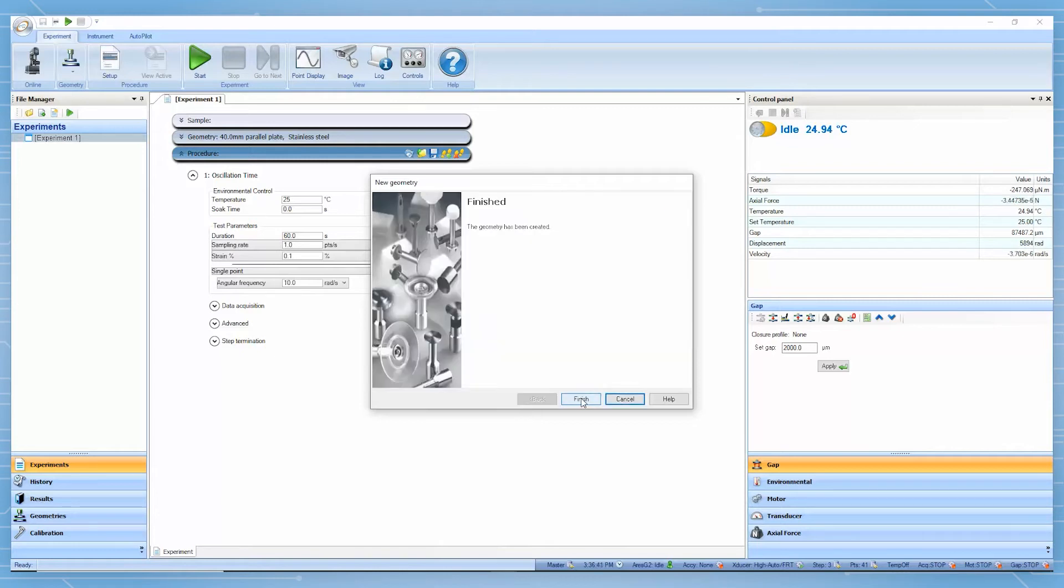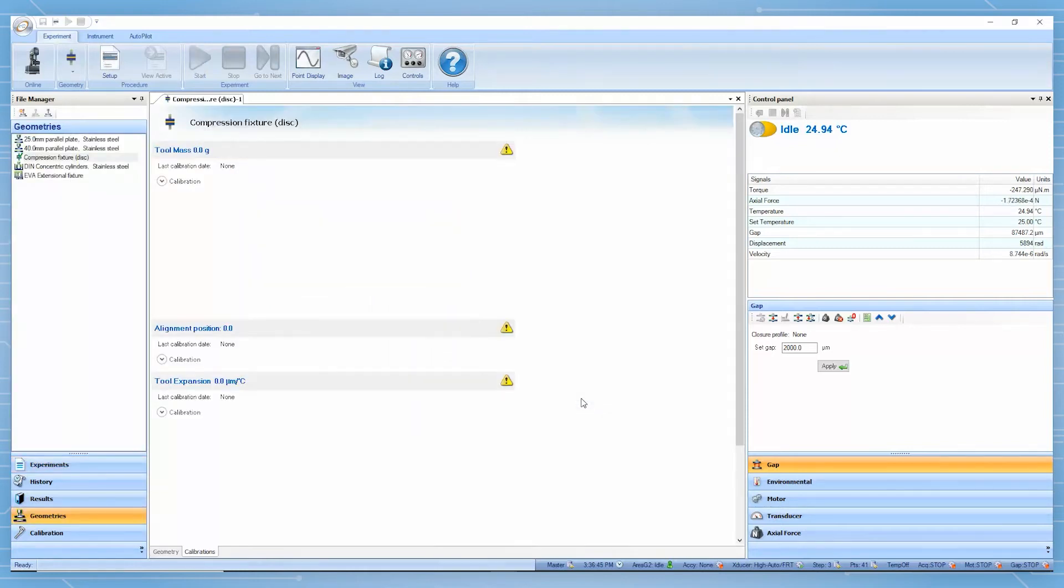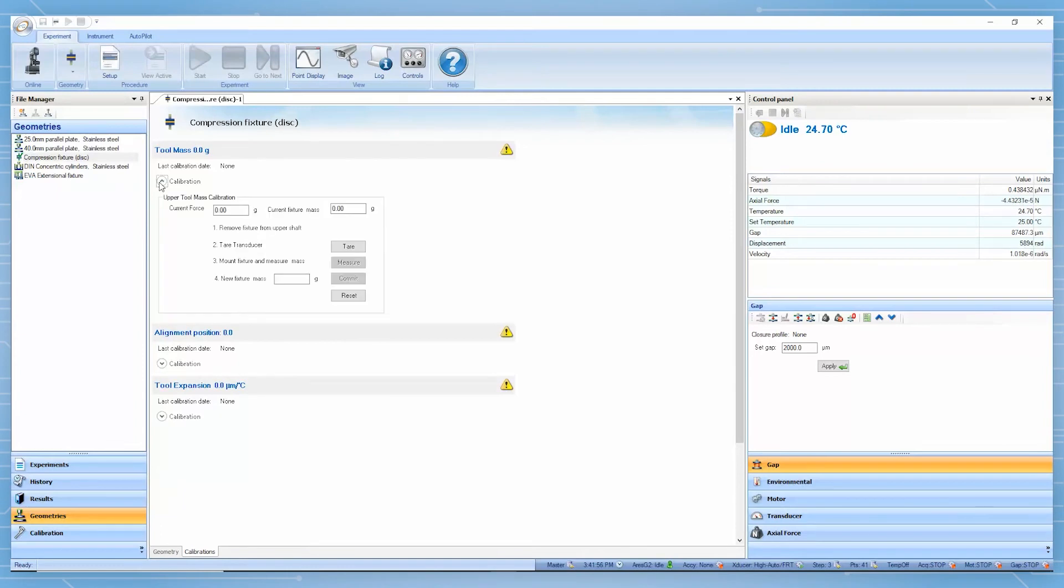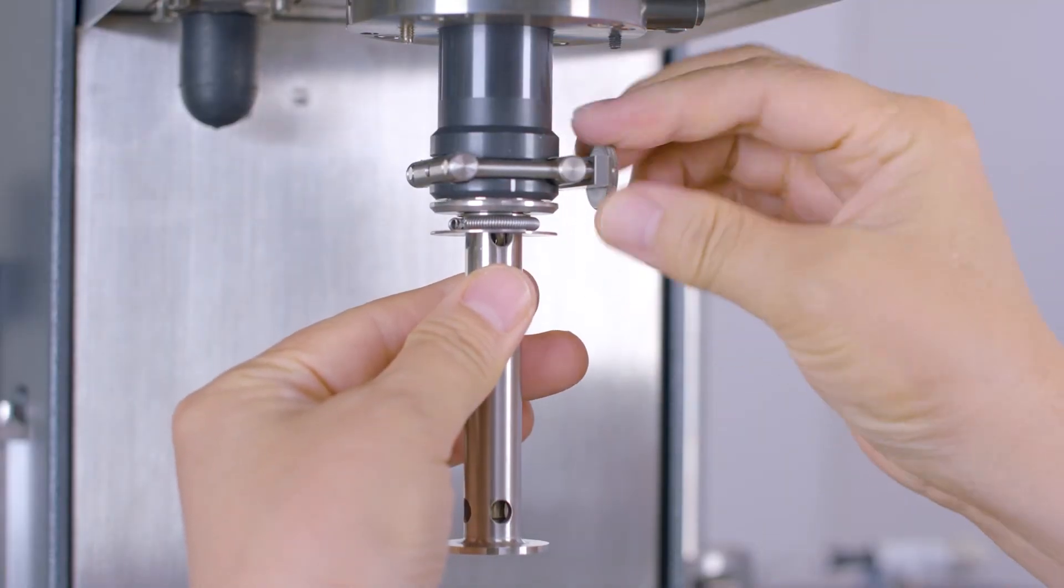Then, TRIOS will lead you to perform the geometry calibration. The first calibration is to measure the upper tube mass. Follow the instruction in TRIOS software. Remove the upper geometry.